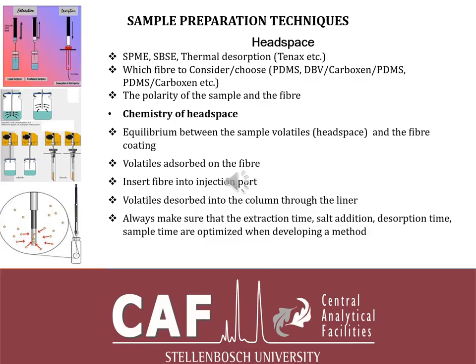They took that magnetic stir bar, put it in another solvent, and spun it in the solvent, then took the solvent and injected it, and they started to see peaks. Then they said, okay, right, we can now maybe coat that stir bar with different coatings, for instance, to see if they can change the polarity of that stir bar to attract the compounds of interest.